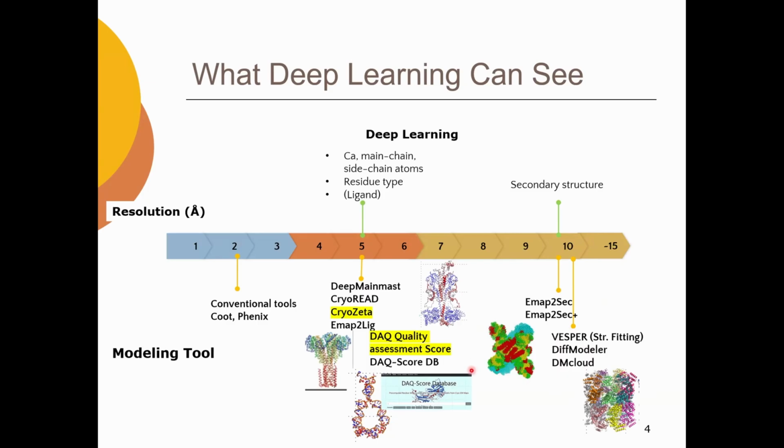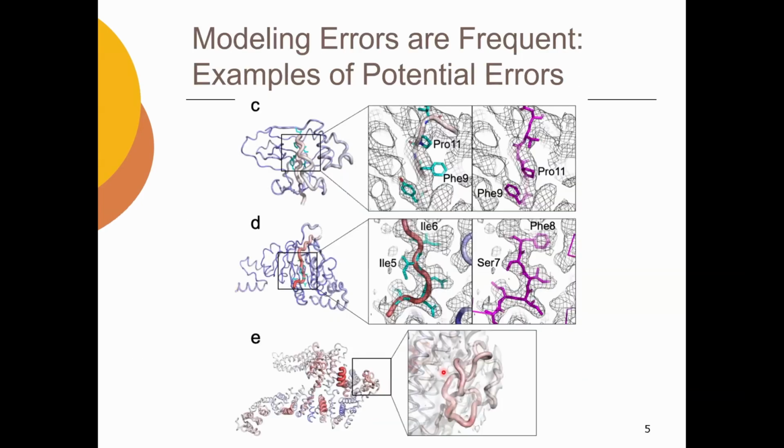But today we focus on the DAQ quality assessment score, because we now have a ChimeraX plugin, which gives you interactive assessment of the model, and then the new method CryoZeta. So I first talk about the concept and approaches of the DAQ score.